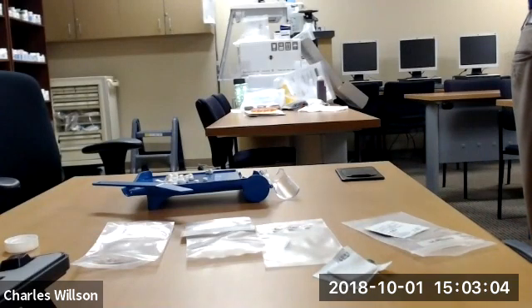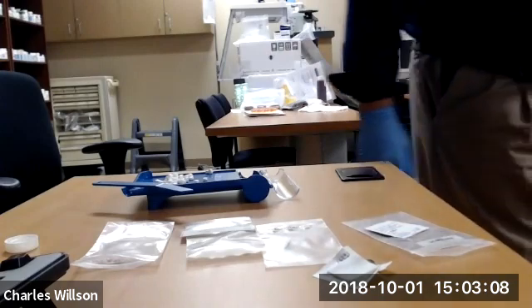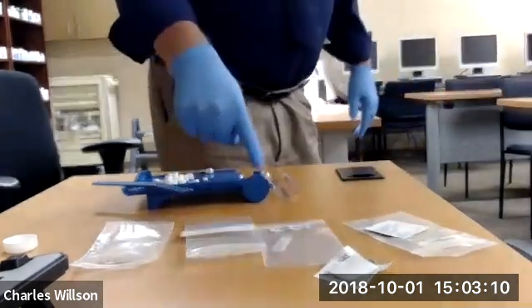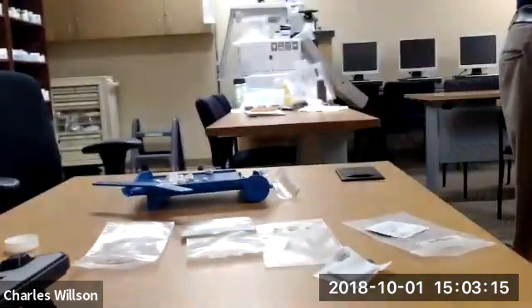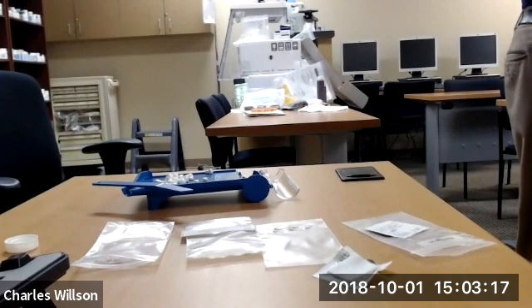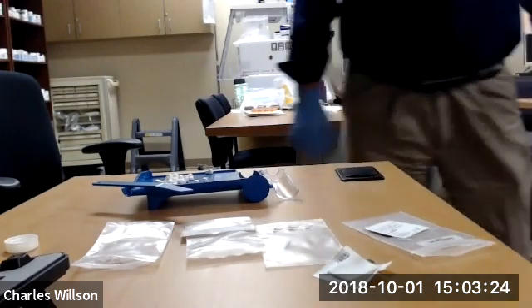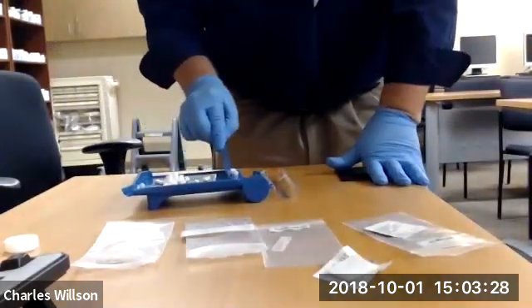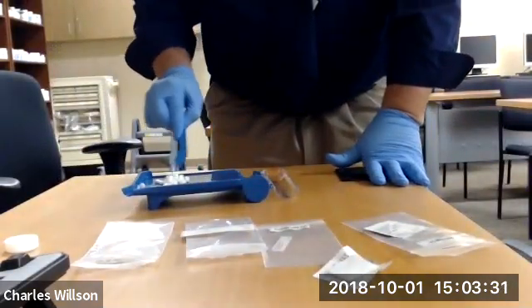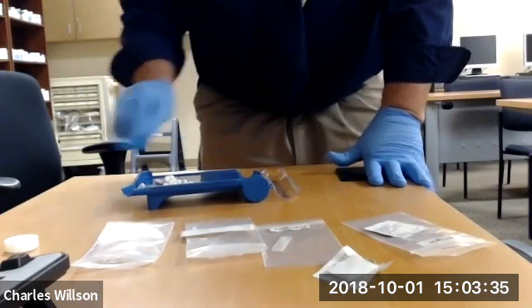Tray well. They call it a tray well. All right, it's not often that you'll work in a pharmacy where they name the parts of the counting tray. But okay. Keeping track of the amount of tablets, use the counting spatula to slide the tablets into the tray well in increments of 5. In other words, count up to 20 by 5s. All right, so there's 5, 10, 15, 20. So that's how it's done.